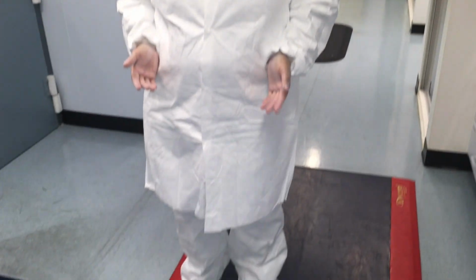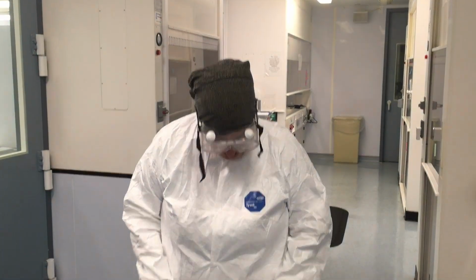So this whole room and the rooms adjoining have HEPA filtered air. They go through a lot of levels of cleaning, and also the air has very tight temperature and humidity control to keep everything very constant. So when we go in, we always have to dress in full personal protective equipment. So we have special shoes, Tyvek suits, goggles, hairnets, and gloves.